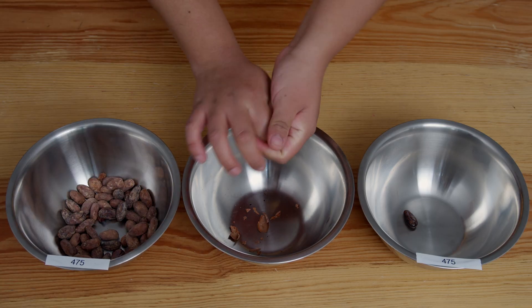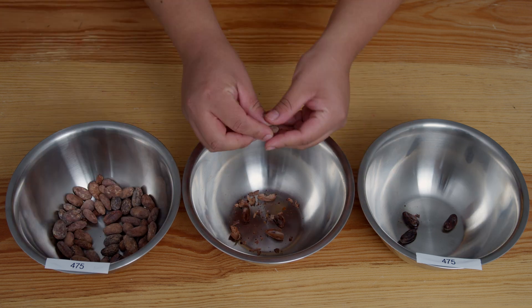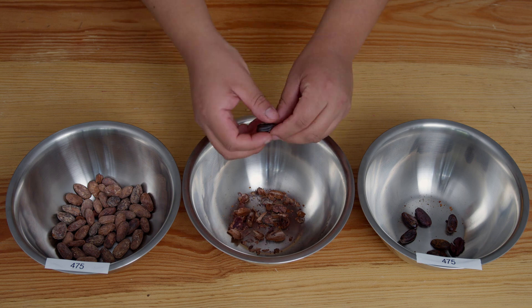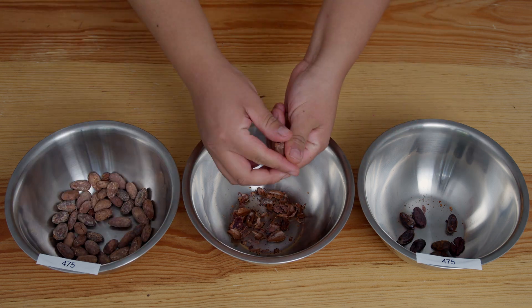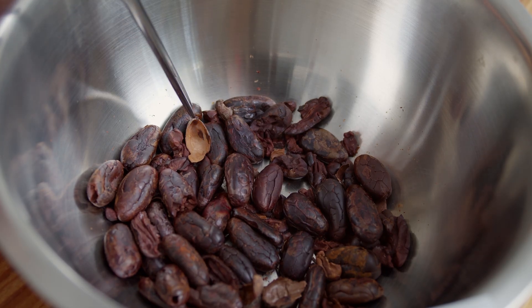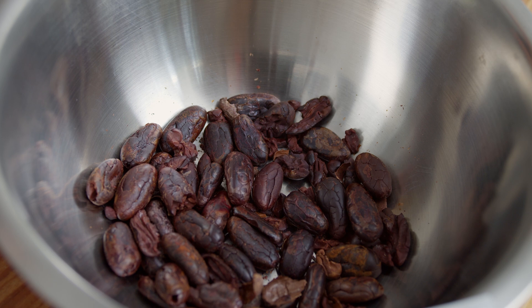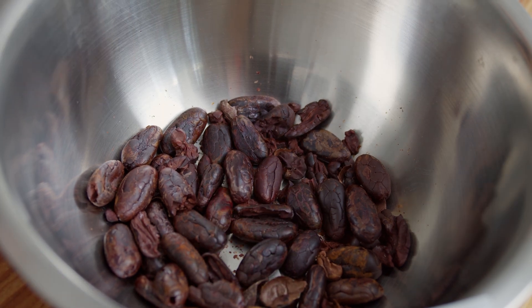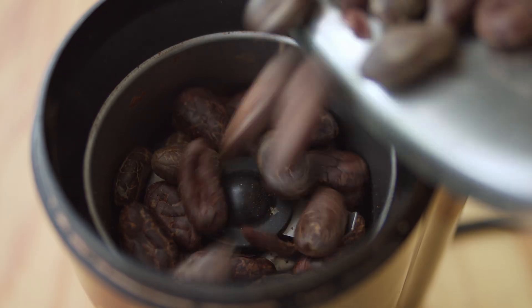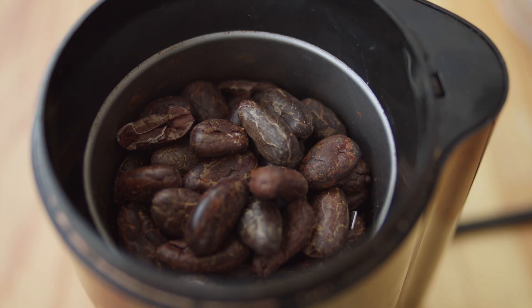Step 4: peel the cacao beans with your fingers to obtain the nibs and collect in a clean bowl. Discard the shells. Step 5: if shell fragments remain on the nibs, use tweezers to remove them all. Step 6: pour the clean, deshelled nibs into the grinder.